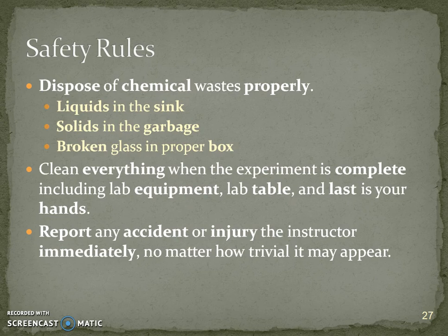Some other ones here. We want to remember that almost always liquids are in the sink, solids are in the garbage. We do not have a garbage disposal in the lab like you do at your house. And if you do have broken glassware, it's going to be in a specific box in the back room. Make sure to clean everything before you use it and after you use it. And of course, your hands should be the very last thing that you wash.